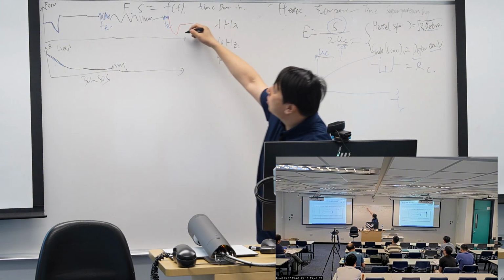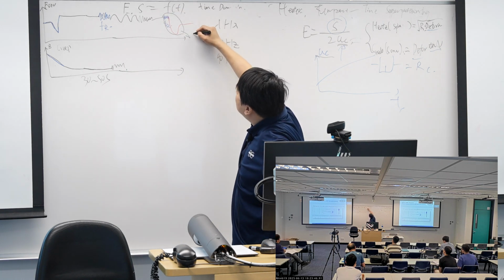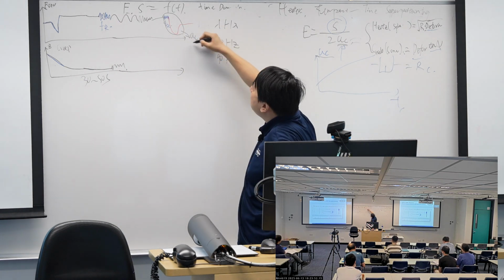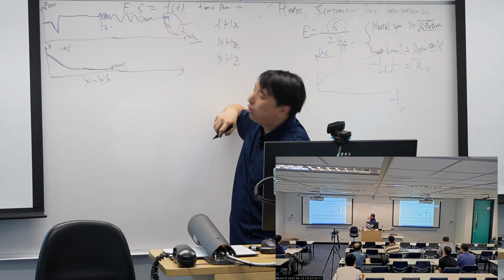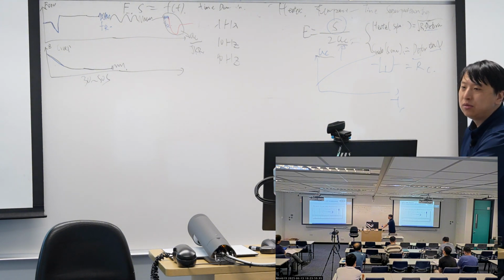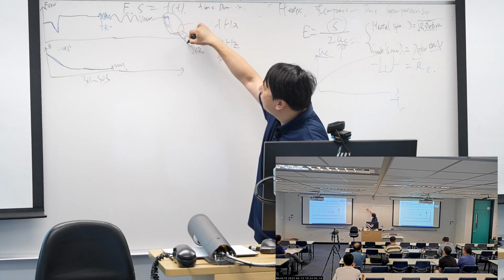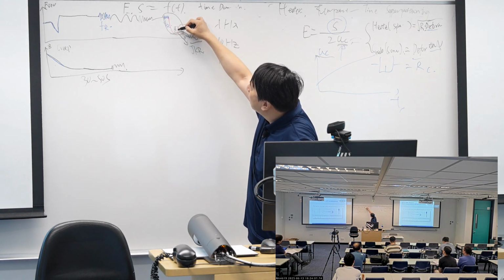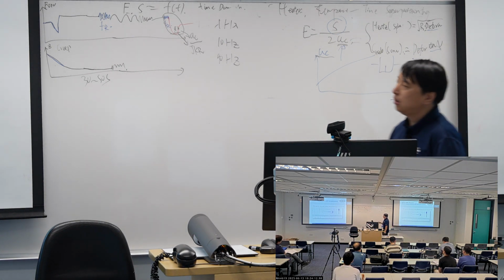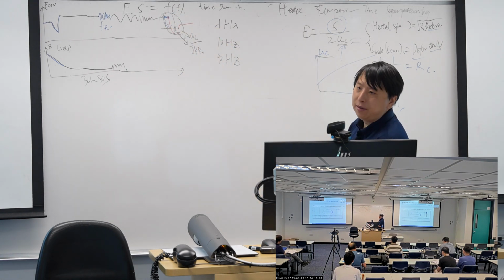And from this force curve, we can get the contact radius at the end of the force curve using a polymer model called JKR. That model lets us calculate the contact radius from the adhesion force. So from this model, we can get the contact radius at the last segment, which is FR.